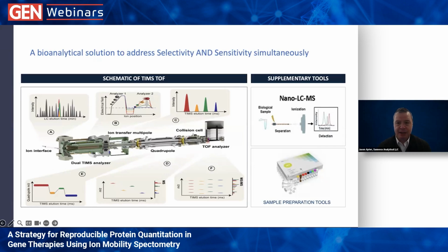David, I'd love you to take us through this approach, which is our view of ion mobility spectrometry, along with various other fringe or supplemental tools that complete the whole system, that really amplify the IMS capabilities of the past to address some of the technical issues within quantitative proteomics.